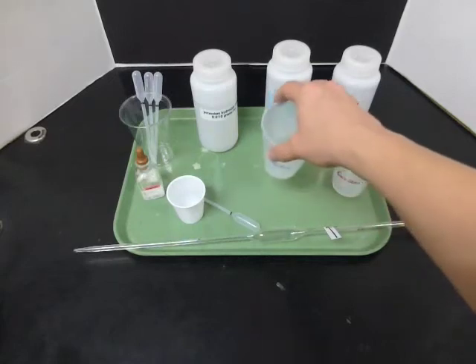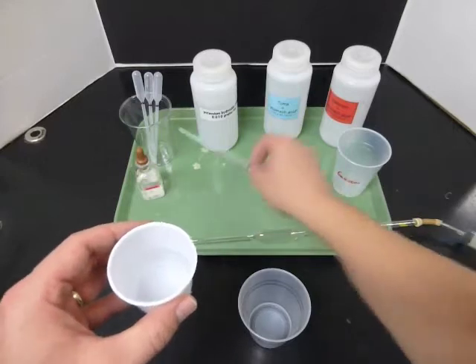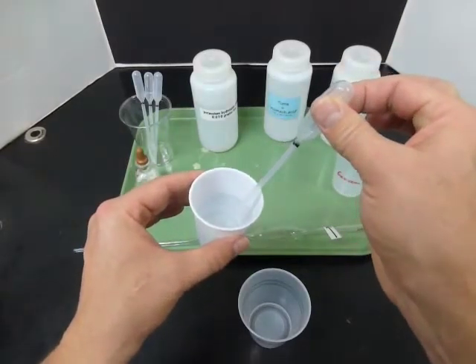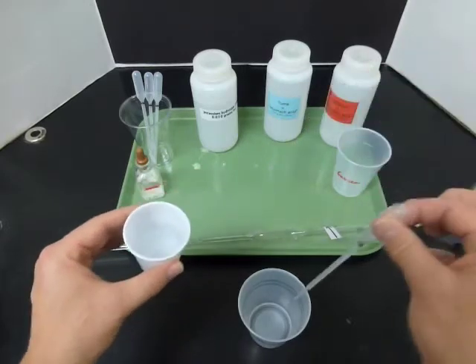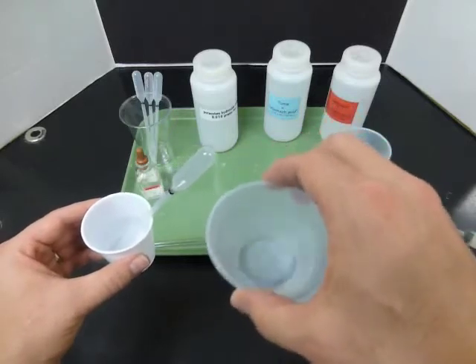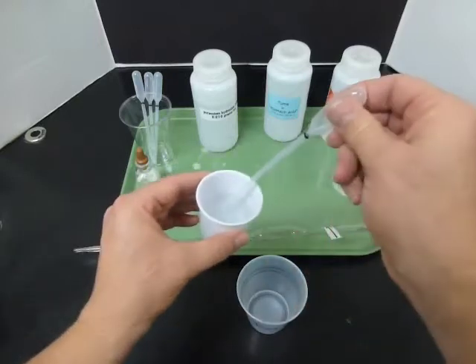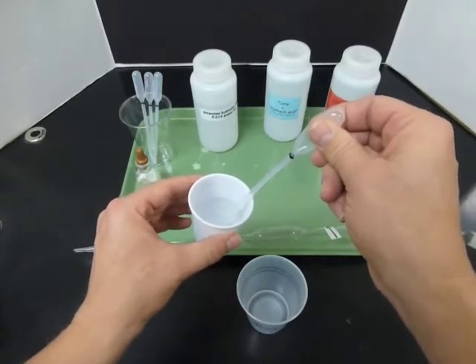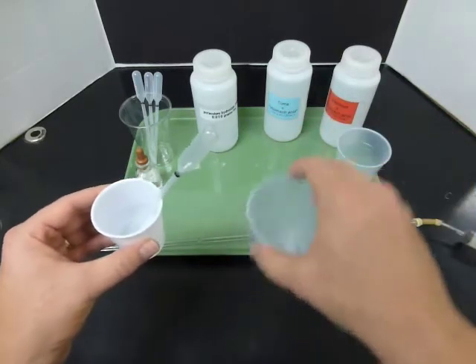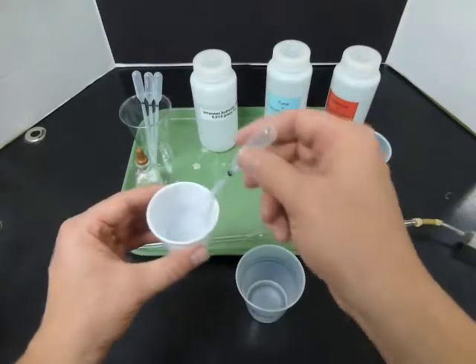Okay, when you're ready to do the titration, what you'll do is take the cup of potassium hydroxide and the little squeezy pipette and draw 1 milliliter, so up to the black line, and put it into the cup and swirl it around. What you're looking for is a pink color change that stays permanent. I don't see a pink color change here, so I'm going to add the second milliliter. So 2. I'm going to keep track of how many I add. And so on. I'll count each milliliter until I get a pink color change that doesn't shake out.